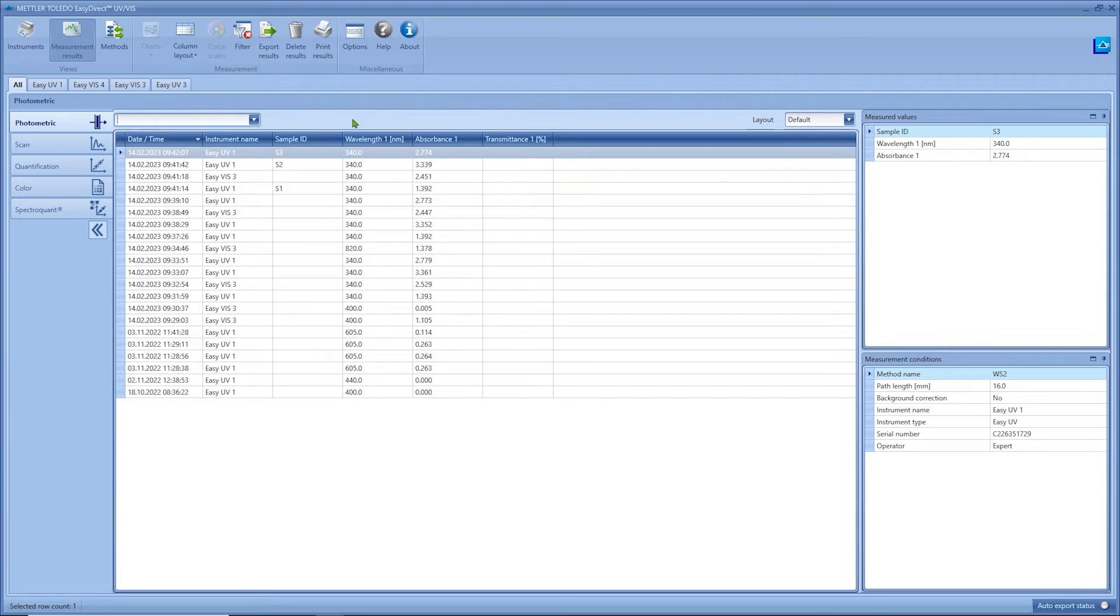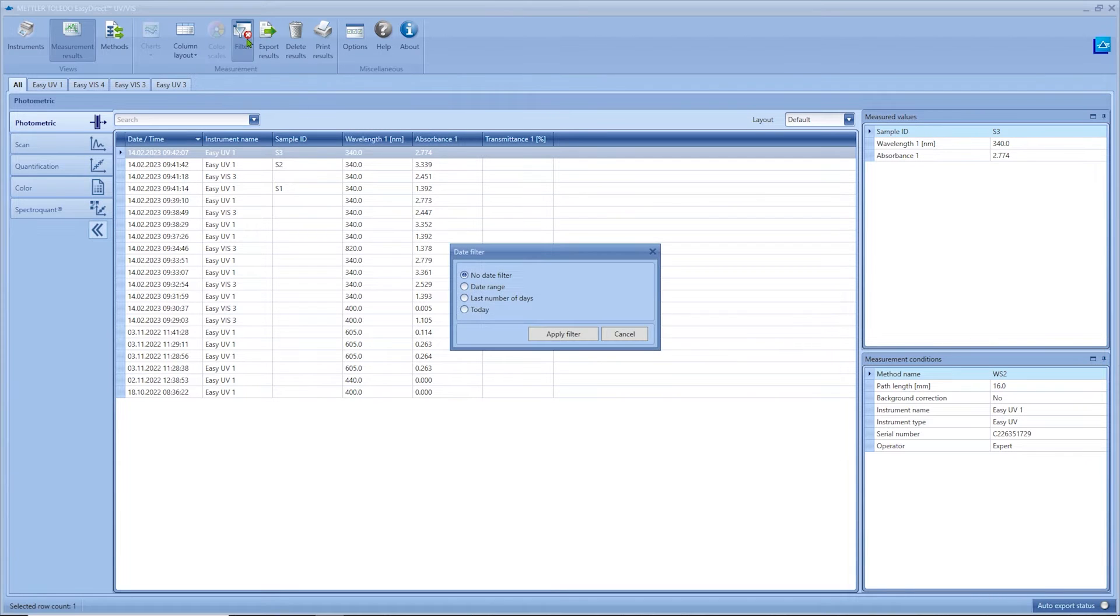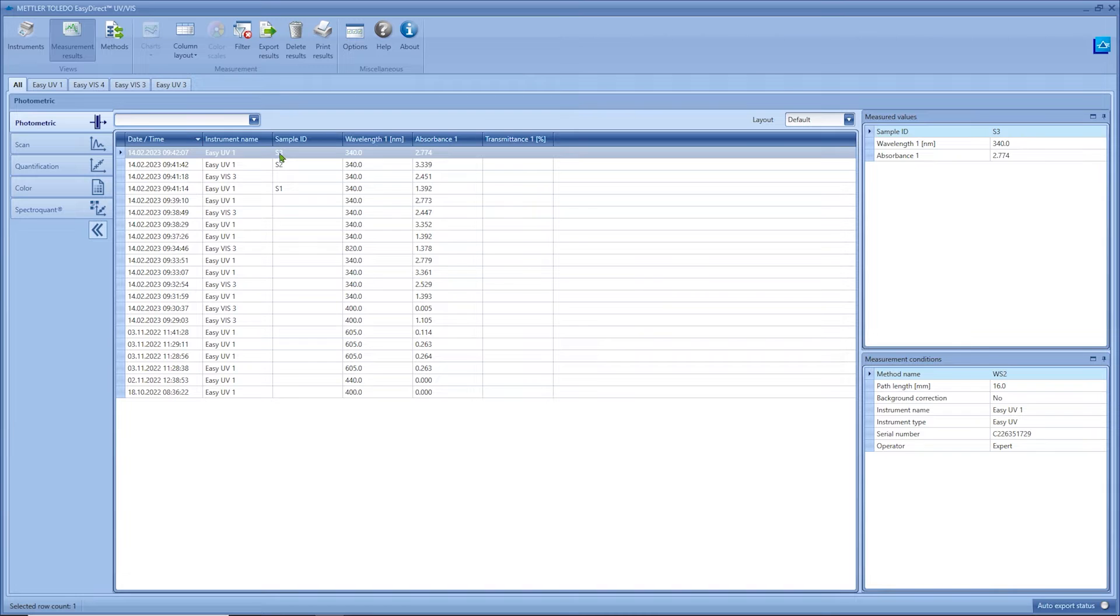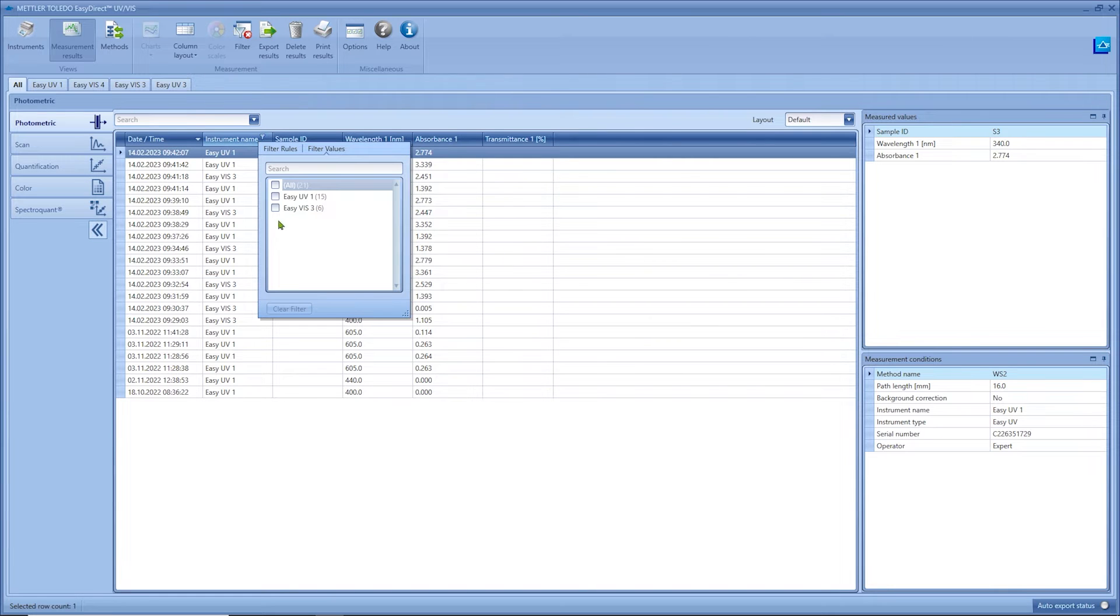You can also apply filter to the main table. The date filter is located here on top but you can also filter in each column by clicking on the funnel symbol in the column header.